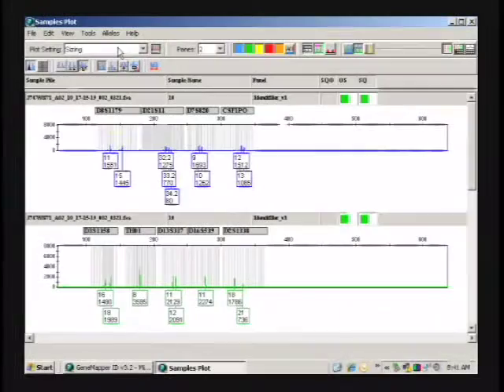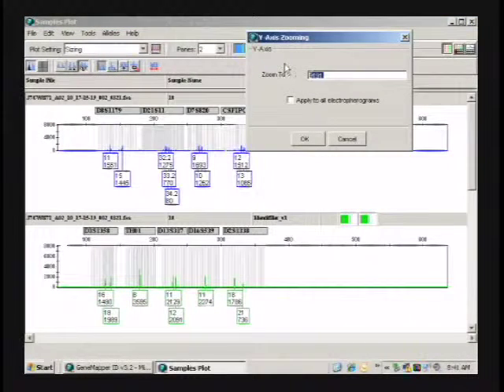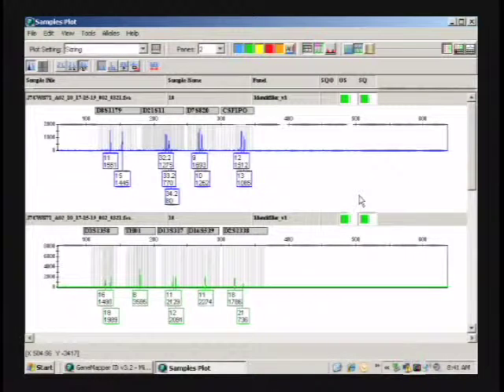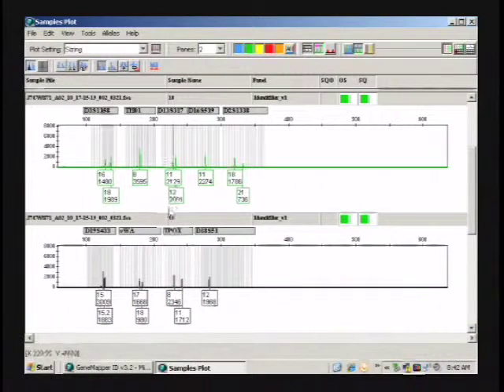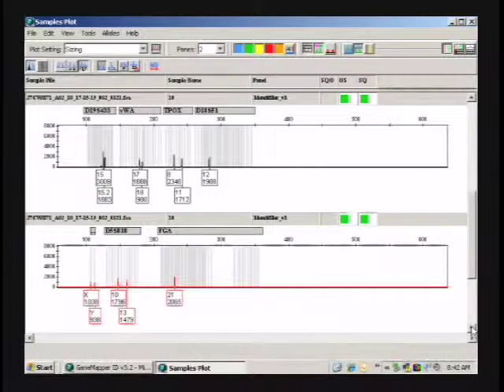I know the early numbers were definitely the 0.1s. So this was a 0.1 here. And as you can see, your peak height's now 1,500, 1,200, 1,000, 1,400, 1,900, 3,000 on that 15 down there. So yes, the good news is it worked.